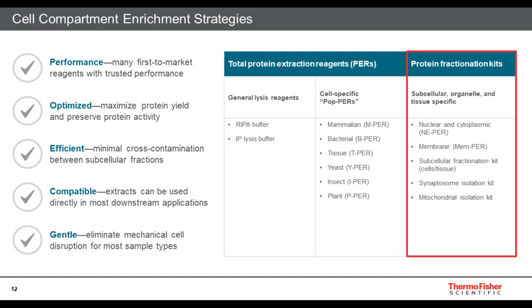So most purification strategies begin with a whole cell lysate buffer, optimized for the model organism used to express the protein. There are lysate buffers optimized for mammalian, bacterial, or yeast cells, maximizing the total amount of protein solubilized while still being gentle enough to maintain native structure and function. And some of these are listed in the middle column of the table on the right.